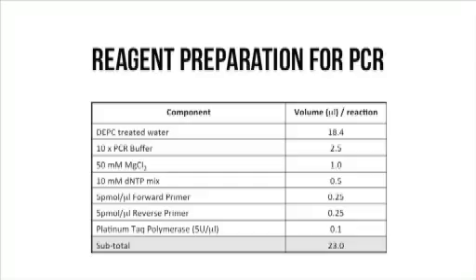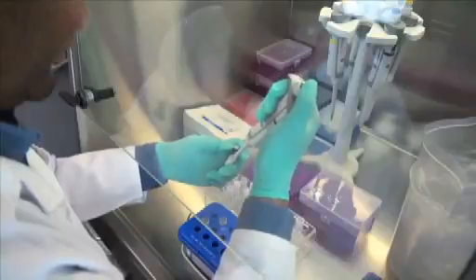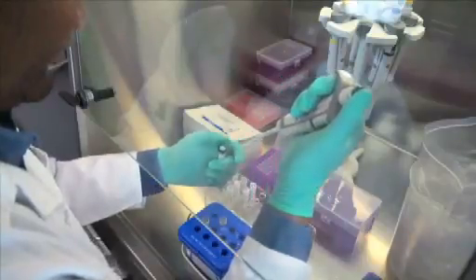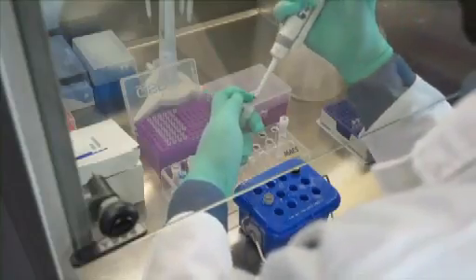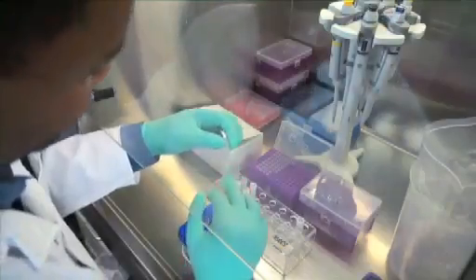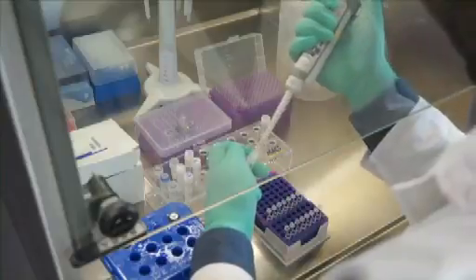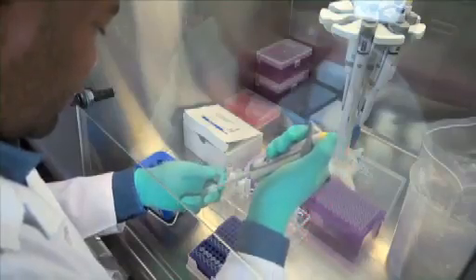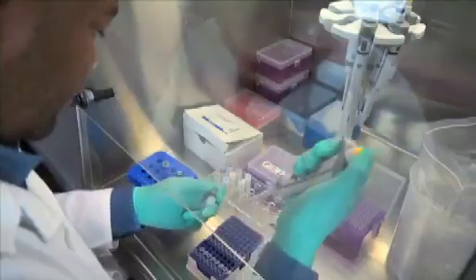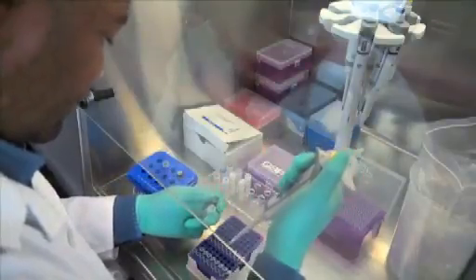Add the water, 10x buffer, magnesium chloride, DNTPs and primers in the amounts shown on the table and vortex. Add 0.1 microliters of platinum Taq polymerase and gently mix. Aliquot 23 microliters of the master mix to 200 microliter PCR tubes. With the master mix tubes on a cold block, move to the PCR room.